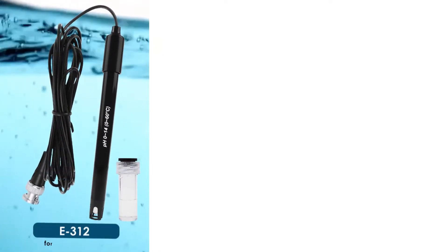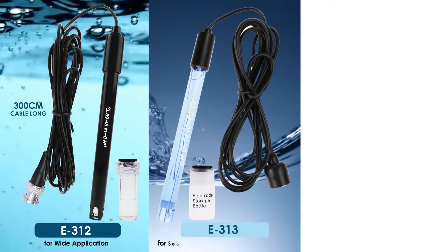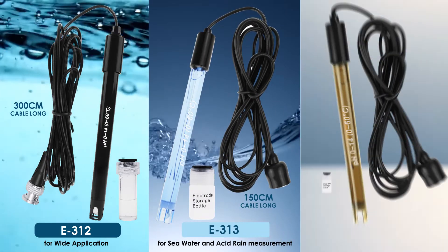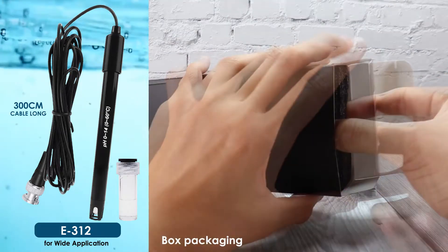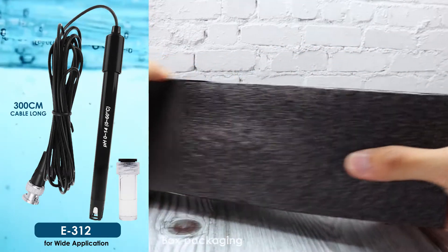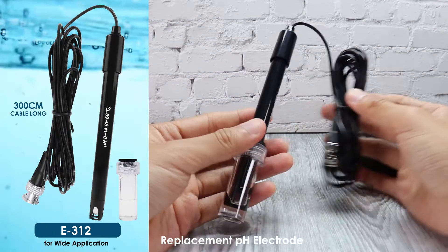Three new replacement pH electrodes: E312 has wide application, E313 measures sea water and acid rain, and E314 can measure liquid continuously. E312 comes with a 300 centimeter cable, three pH powders, and its own storage bottle.